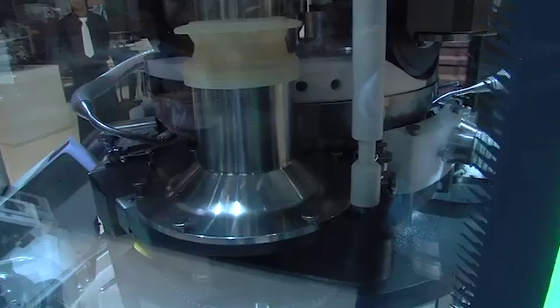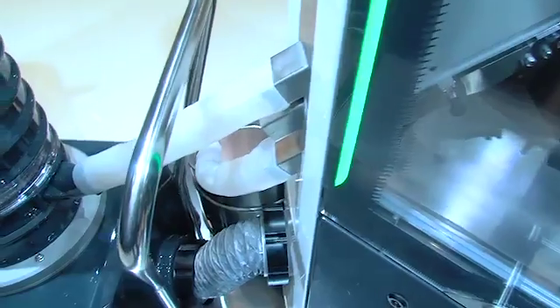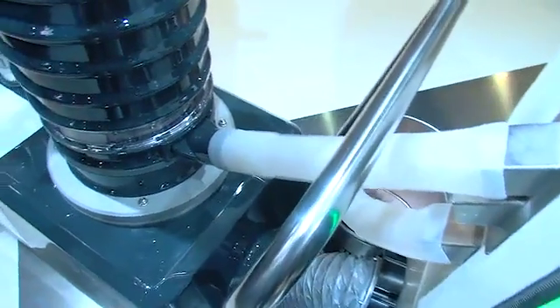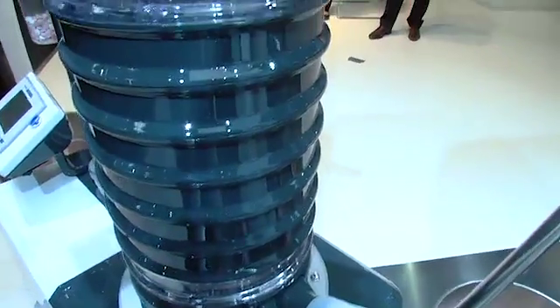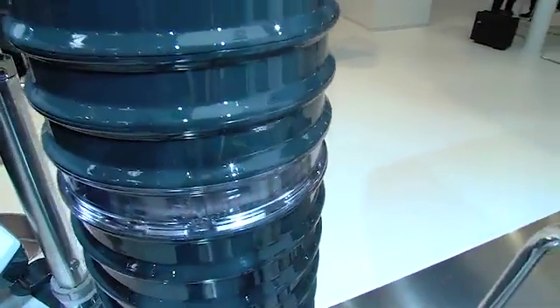As you can see, with the machine itself and on the overhead screen, we're running in bilayer mode. You have a white layer for the first layer, pink for the second, and as the machine goes through final compression, it goes through a dust-tight chute, through the corner column as described, into the uphill de-duster, finally through metal check, and your finished tablets.